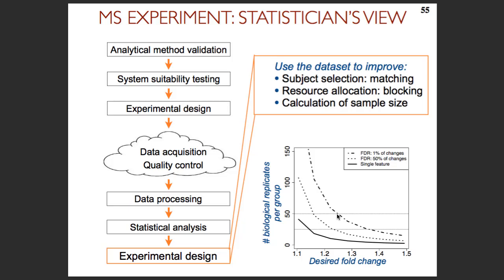What we said last time was that if we have a targeted experiment where most proteins are expected to change in abundance, we typically need a smaller sample size than a global discovery experiment where only a few proteins change. The reason is that when we plan these experiments, we control for false positives, or false discoveries. If in the future experiment everything is changing, there are few opportunities for false discoveries, so it's easier. But in an experiment with many proteins where only a few are changing, there is more opportunity for false positives, so we need to work harder to protect ourselves against them. In this context, it means having a larger sample size. We discussed this quite a bit last week. It's on YouTube if you want to review this. I'm also happy to answer questions if you were not with us last week.